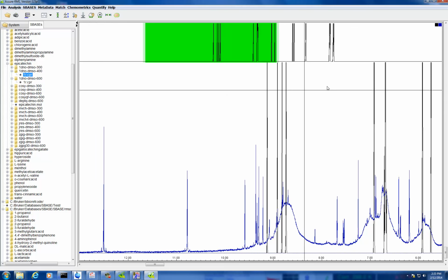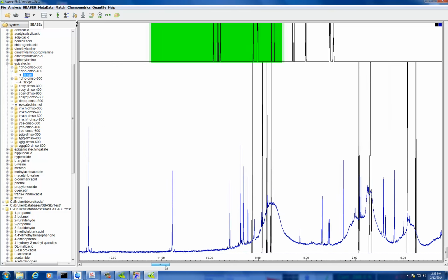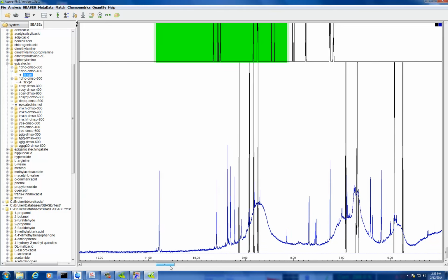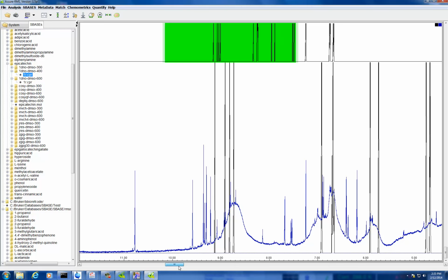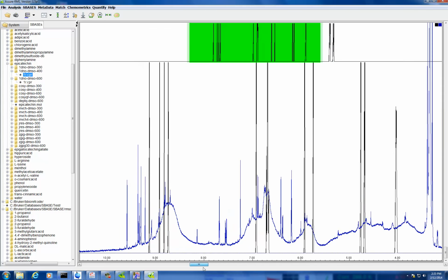Okay, I see. It's really broad. Crazy broad. Well, we had PAC fractions that Sarah had run before, which may look something like that. I mean, yours is a fraction, right? Which one is a fraction? PQCJ7. Yeah, that one's got a lot of stuff. It's still doable, but obviously it's better if it's less. Yeah, that baseline. And I think the experiment you run isn't ideal for running these experiments.